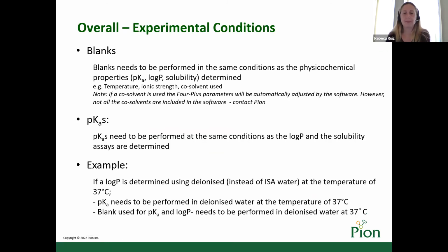Summarizing. Blanks need to be performed in the same conditions as any of the physicochemical properties determined, so pKa, log P, or solubility: same ionic strength and same temperature, except when we are using co-solvents, because the software will correct the four-plus parameters automatically.